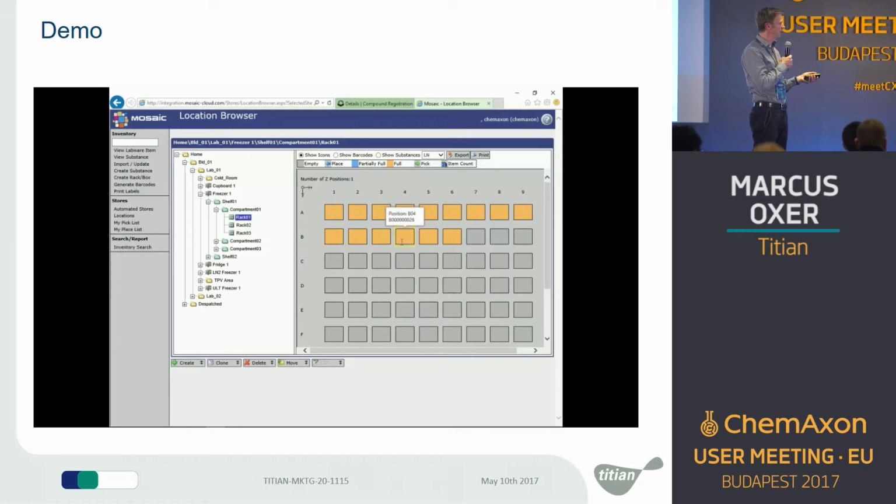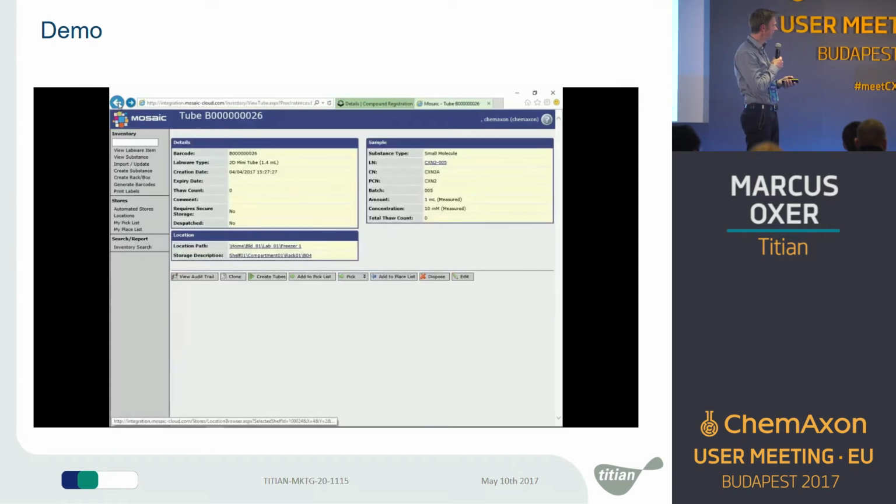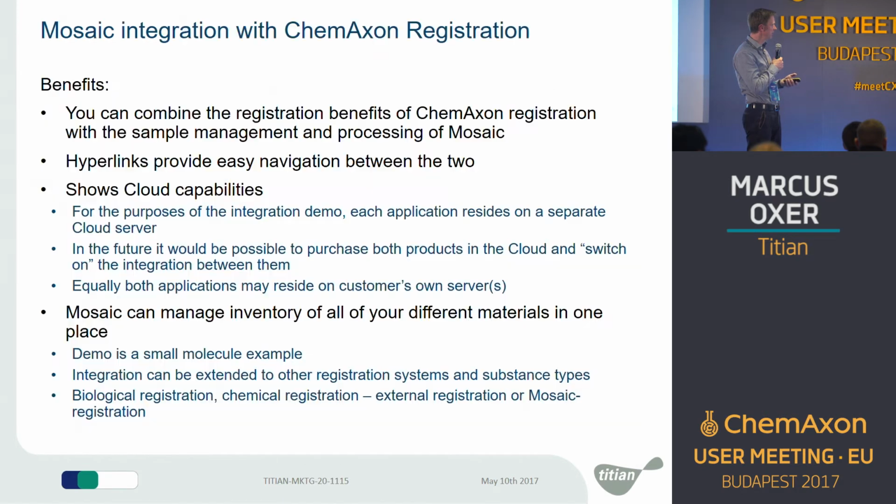So everything we were doing there was also being captured in an audit trail. I won't show that in the interest of time. I'll just jump to the next slide.